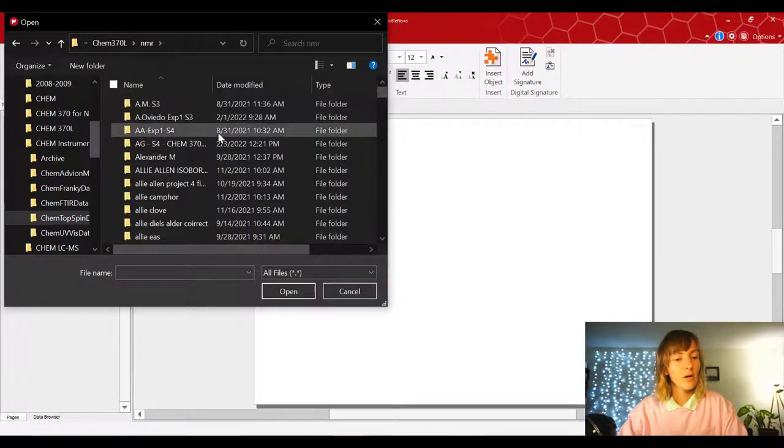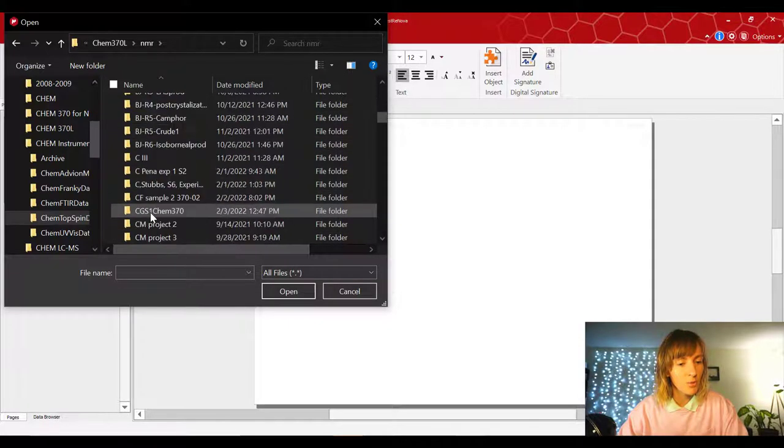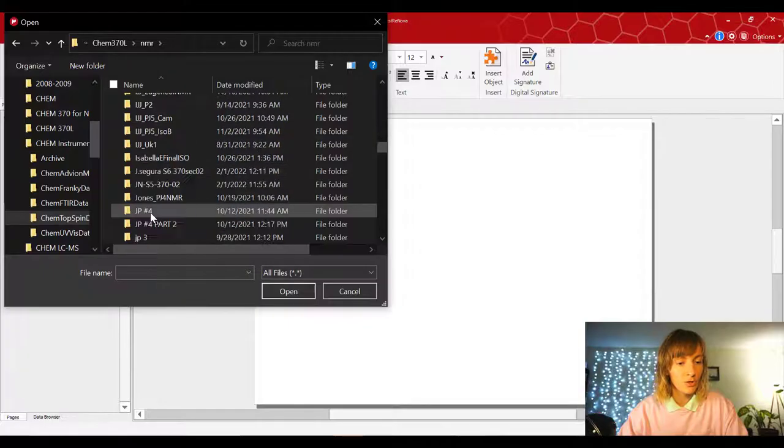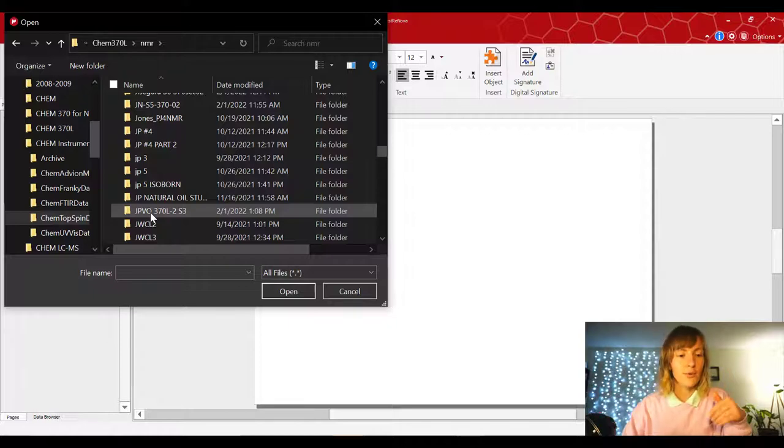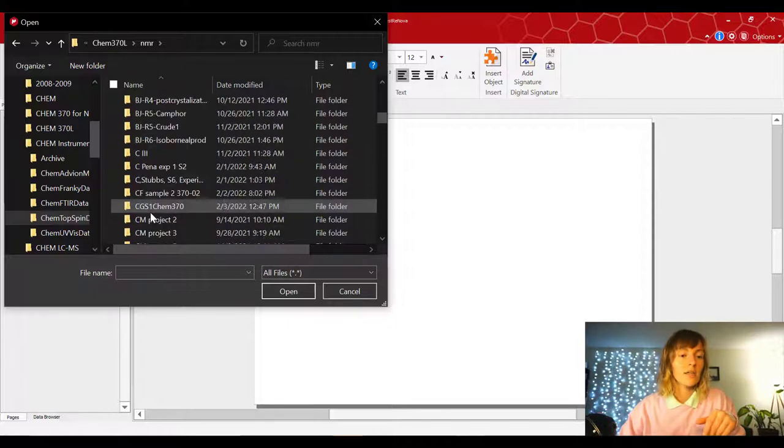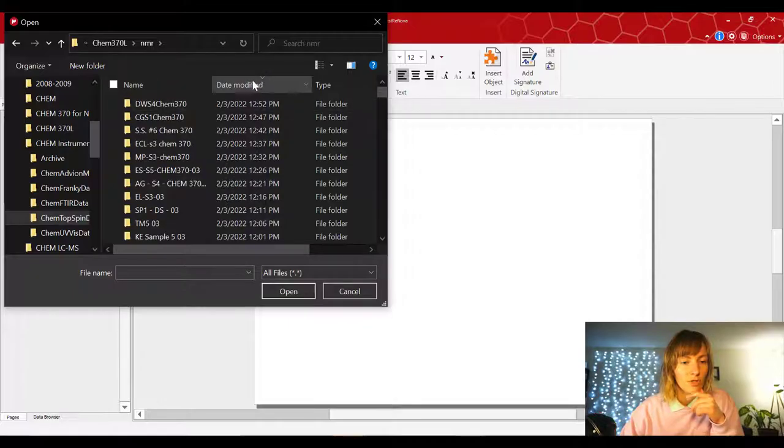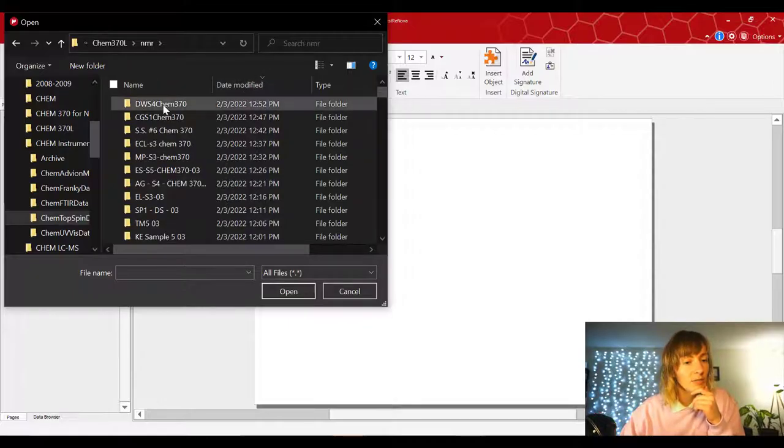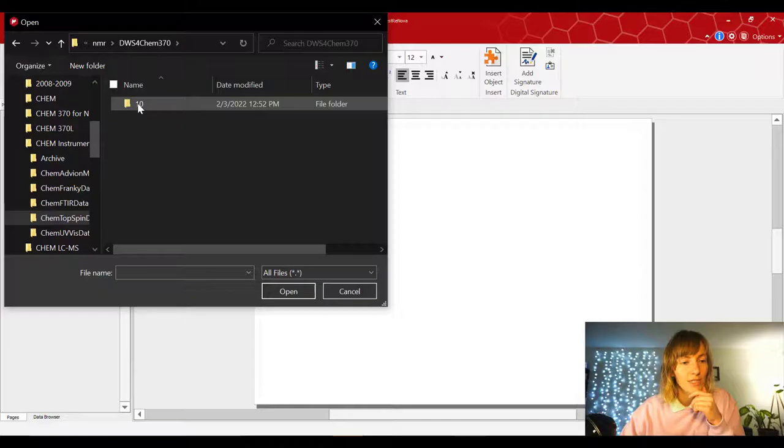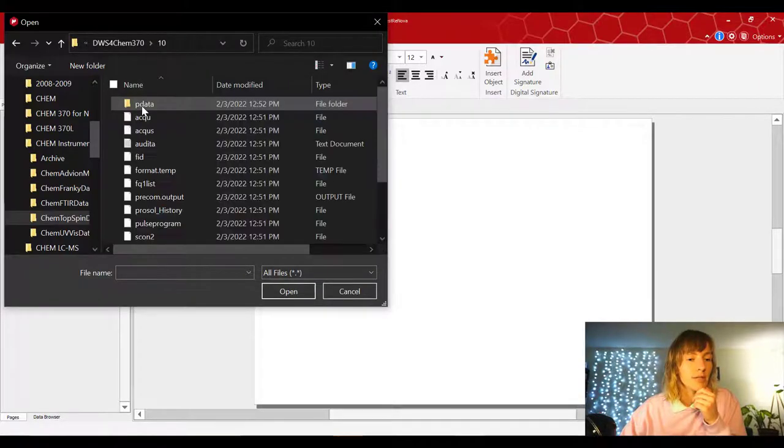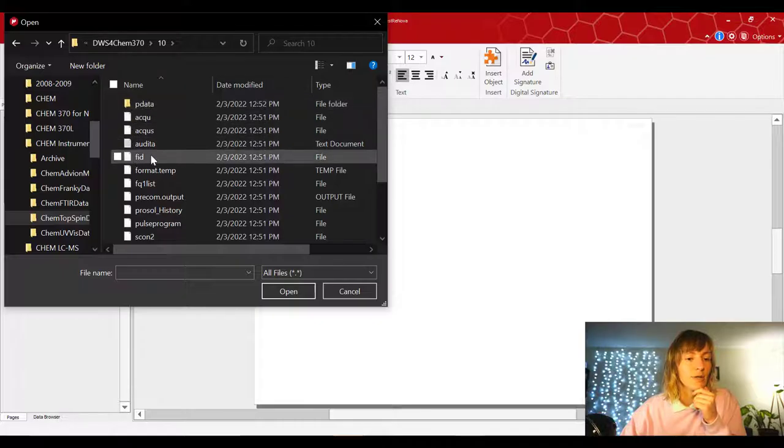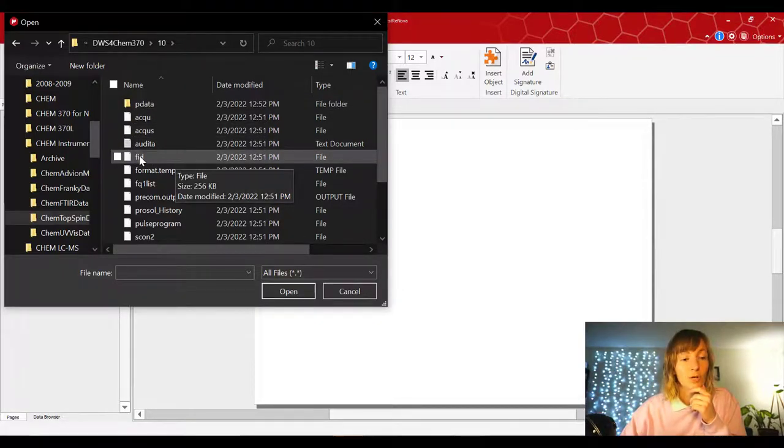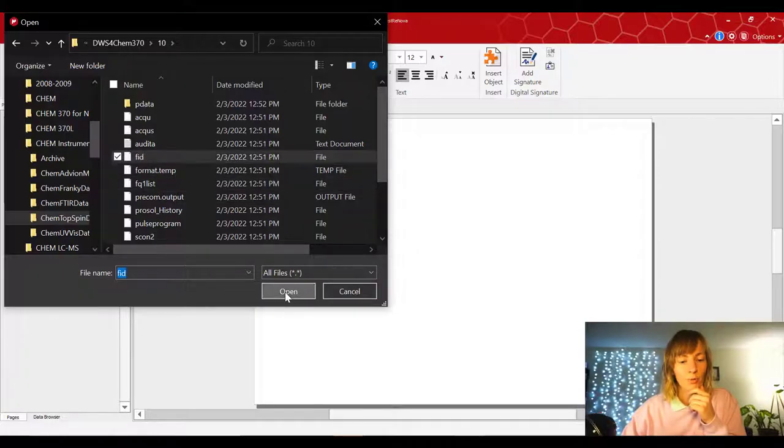And now find whatever file you put in there, whatever file you stored. So it should be, I think most of you saved it as your initials, sample number, and section number. I'm just gonna choose the latest one, so I'm just gonna sort them by date. And I'm literally just gonna pick the latest one as an example. So double click on the sample name, double click on this 10 folder, and then look for the FID file. This FID file is the one that's gonna contain your NMR information. So select it and either double click it or press open.